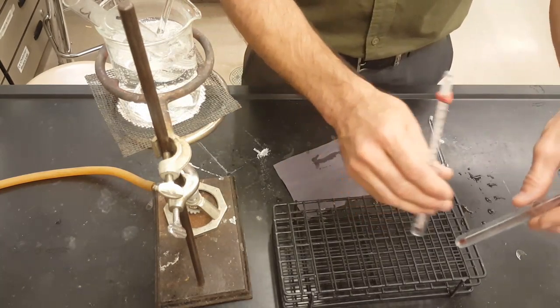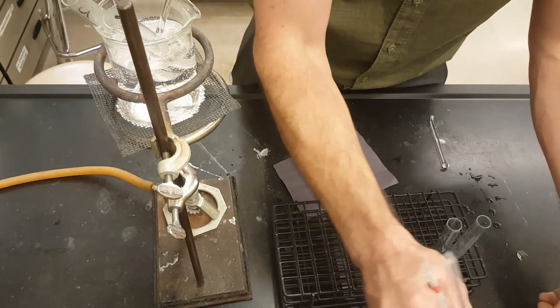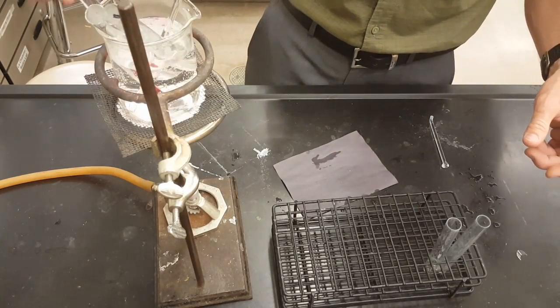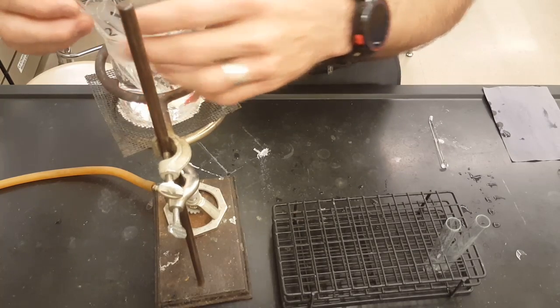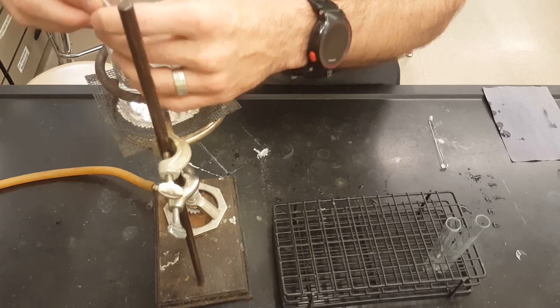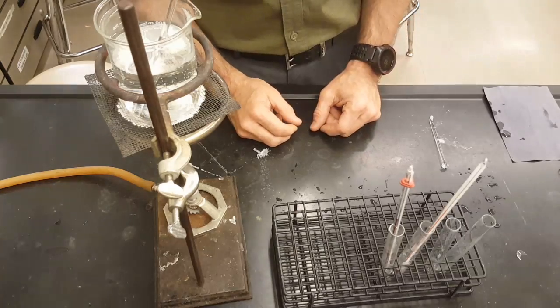All right. Now, once you've done that for these 2, you've got to wash your thermometers off. Place them back into the warm test tube bath. And once they're warmed back up to equilibrium temperature, go ahead and place your thermometers in the last 2 test tubes and put them into your rack. And do the same thing.